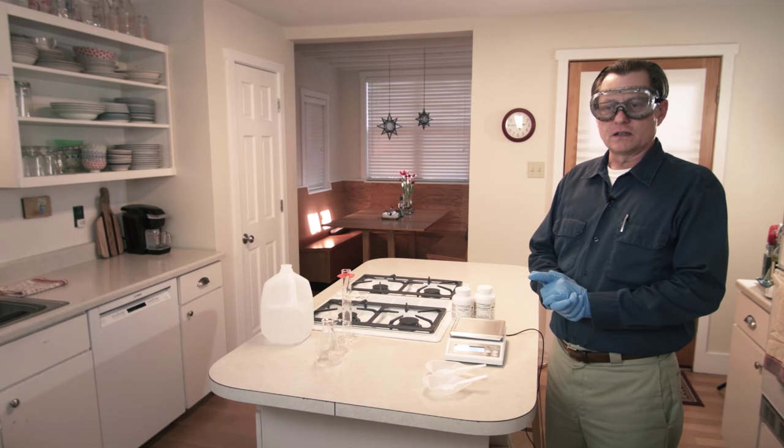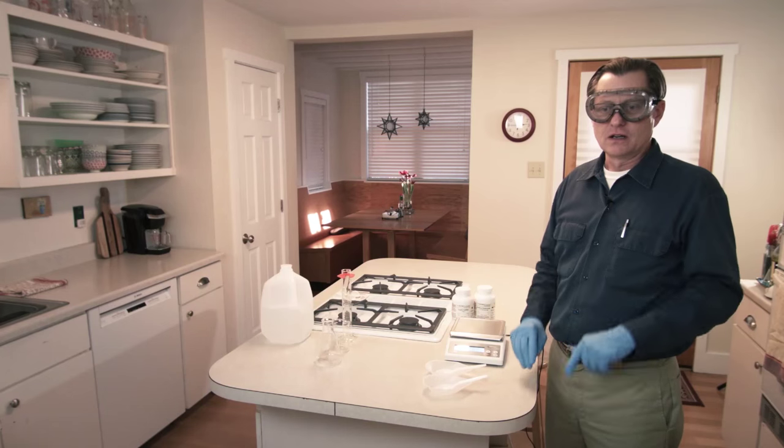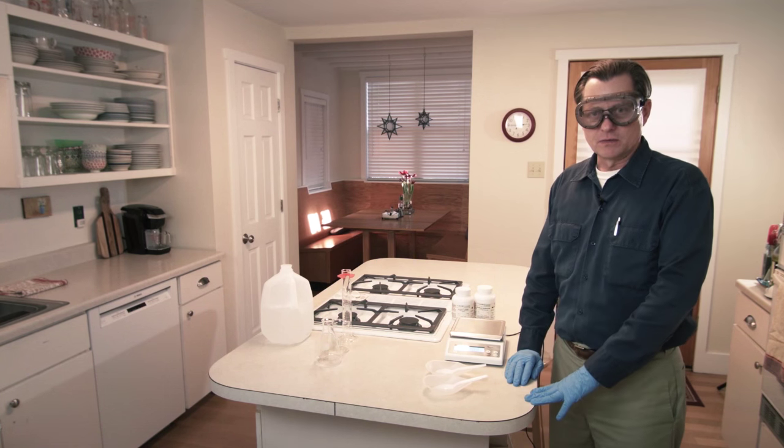If you do want to do this experiment, there are some important safety concerns. You'll notice I'm wearing nitrile gloves and safety goggles, which should always be done when you're mixing chemicals.